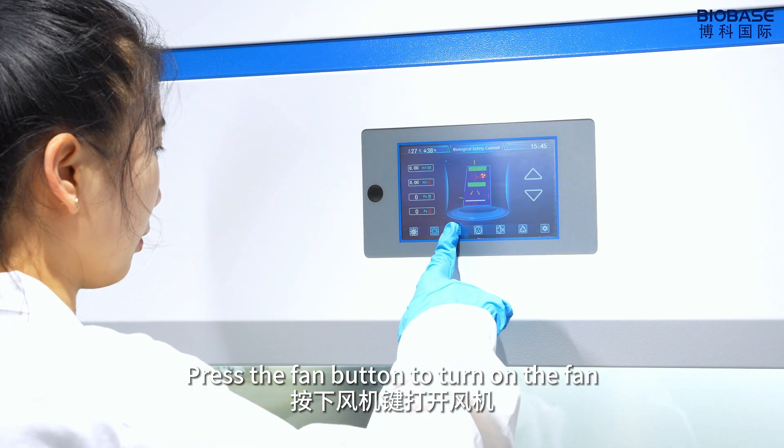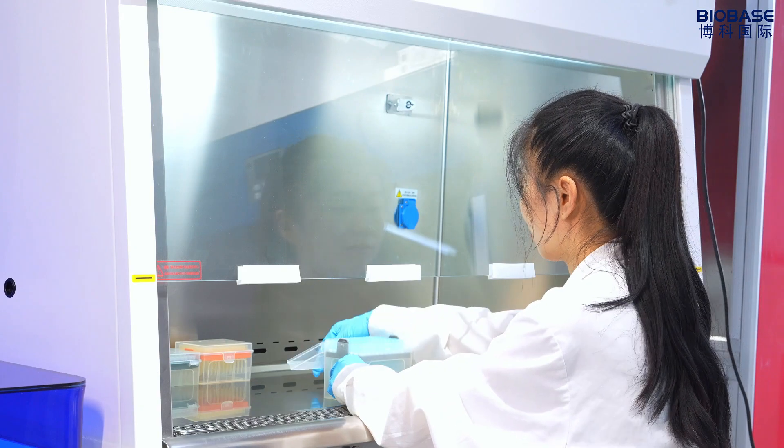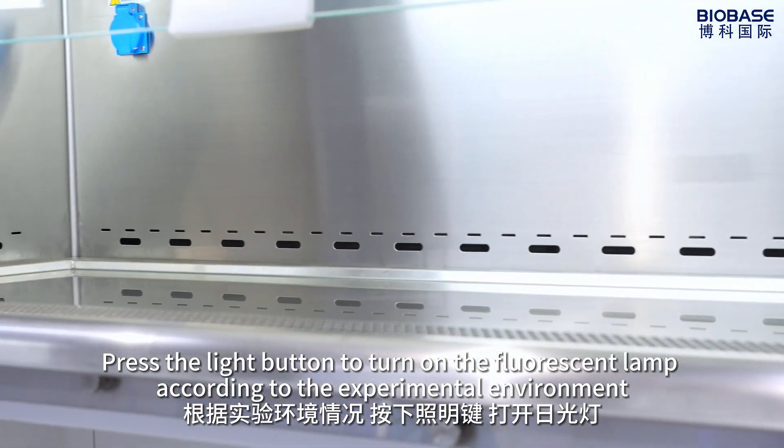Press the fan button to turn on the fan. Run for at least 5 minutes before performing the experiment. Press the light button to turn on the fluorescent lamp according to the experimental environment.